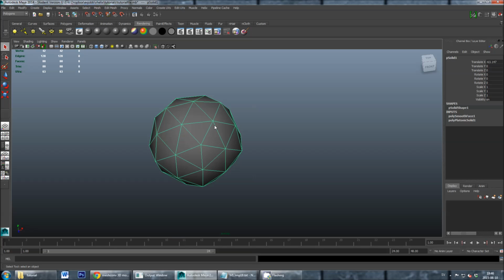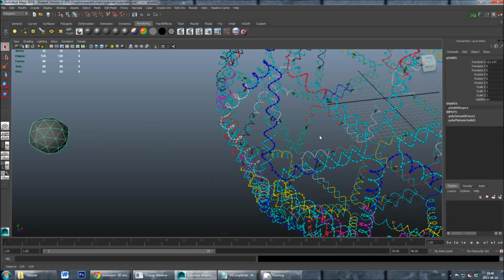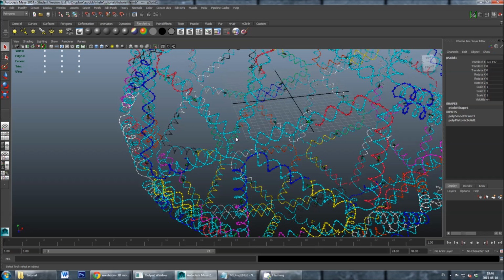Hello and welcome to this tutorial where I will show you how to use vHelix in combination with our new scaffold routing software to go from an arbitrary polyhedral mesh into a DNA nanostructure design. And I will show you how to design staples and how to assign these with a sequence from a scaffold strand and how to export these sequences for later production.